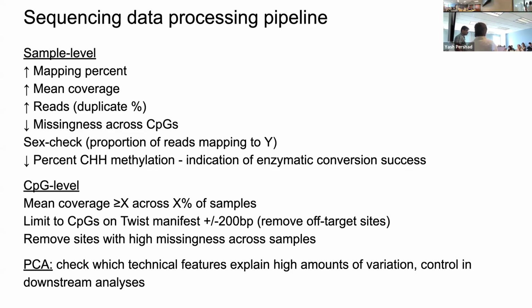And then for the data, it kind of depends on how many reads you gave to an experiment. But typically I would say a minimum of no less than 5 on average across 75% of samples. That's pretty low, and your data will probably be much higher than that. And I'm happy to provide some information, because reviewers in particular can be very picky about methylation from sequencing-based methylation technologies.